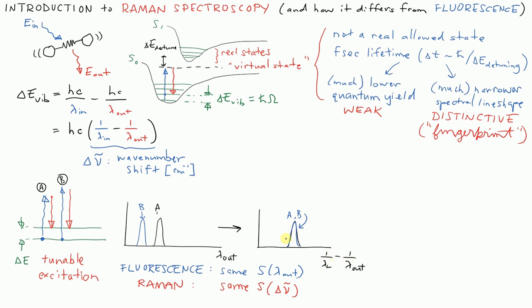The last thing I want to say in this tutorial is to get into the conceptual idea of why are these new frequencies being created when a photon strikes a molecule.